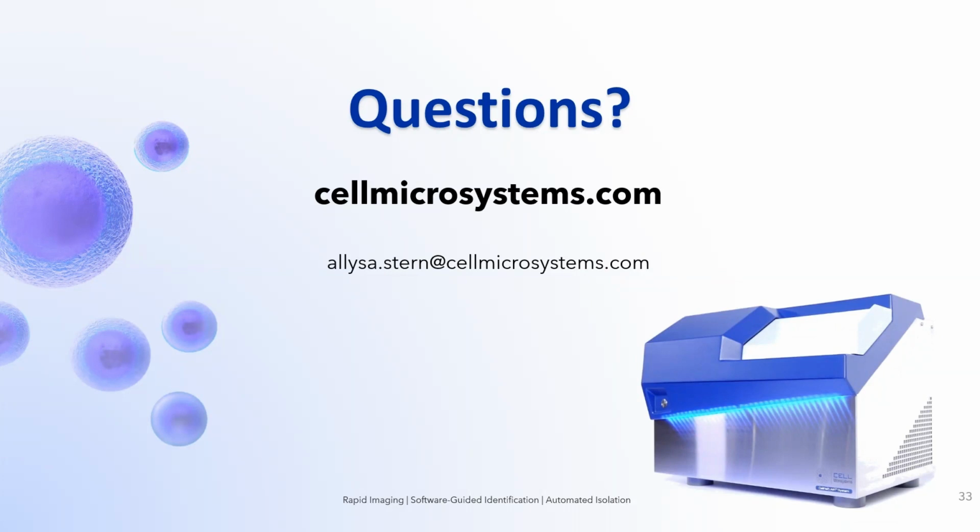Okay, next question is, how does the organoid size affect the outcome of the assay? And what is the optimum size for each organoid to start induction or excluding it from further assay? I think that is also a model dependent question. These iPSC organoids that have a much longer maturation after isolation, I don't think it's as imperative that you select a specific size rather than just limit your size range so that you have assay consistency downstream.